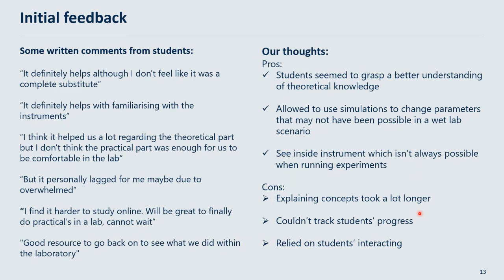And we also used some additional software that were simulations of the equipment, and students fed back that it was nice that they could try changing different parameters that may not have been realistic to do in a laboratory setting, but also they may have been too scared to do it. So it allowed them to test these things without worrying about breaking the equipment, but also getting a much quicker turnaround of results.